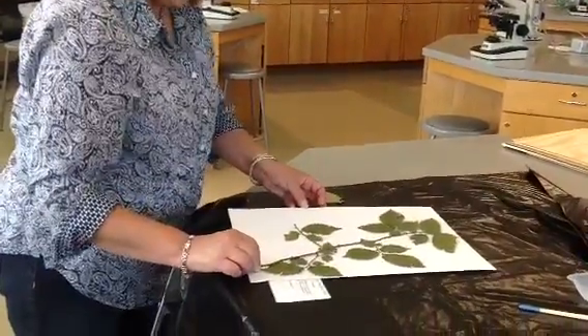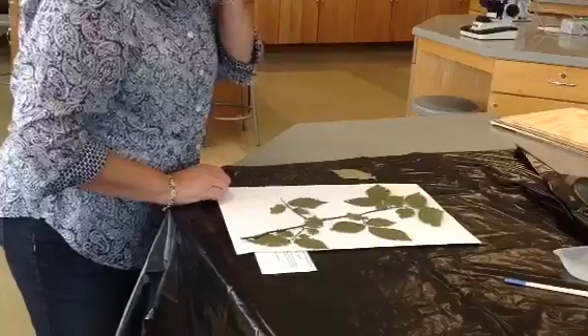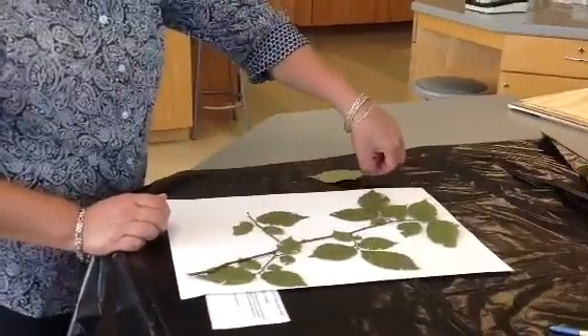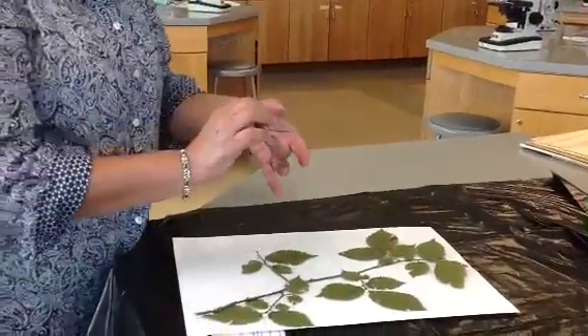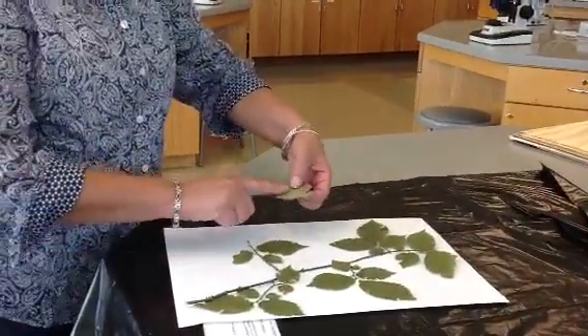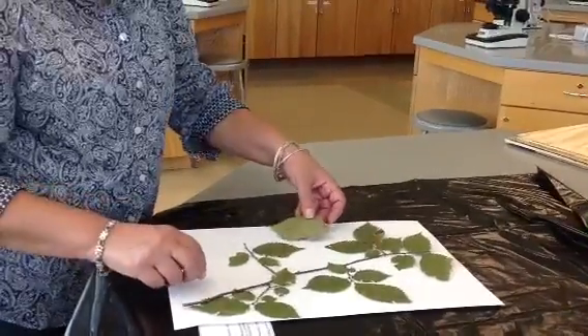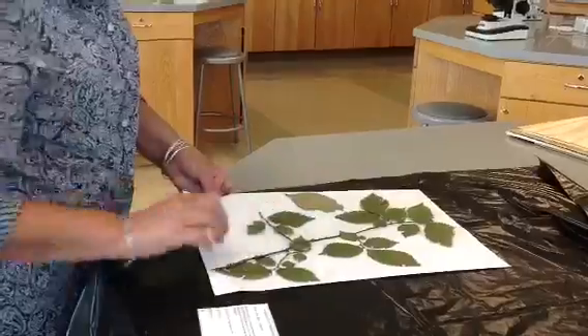I'm going to move this sample around and make sure that I have it properly placed and have an idea where I'm going to put it. I also have this one leaf that is detached, but I can actually put this leaf and glue it on so that I can see the underside of the foliage. That can be placed on the paper as well. So I'm going to put this side up on the paper.